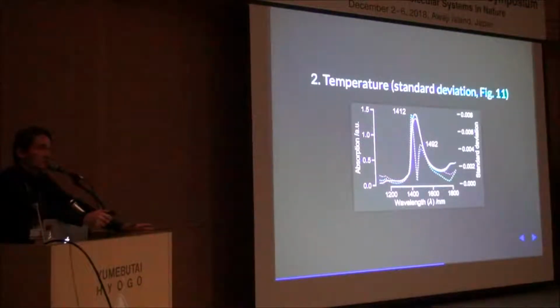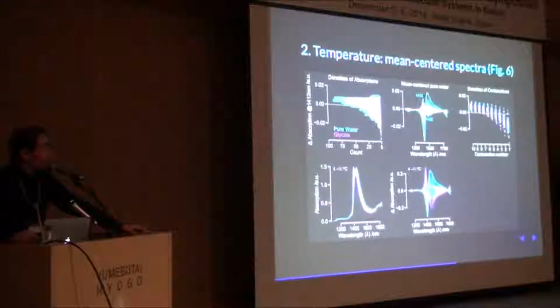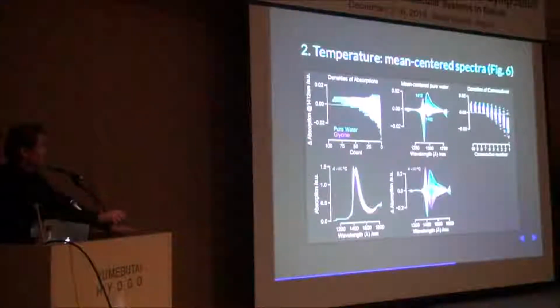So standard deviation is basically a variation around the mean value. If you have water in these solutions, that's your mean value, and the water-related near-infrared bands are what the standard deviation is telling you. So directly from this picture, you can learn that the third decimal are the bands of glycine. They go up and down depending on the concentration, but the third decimal is where they are located. Okay, so this is a little bit busy slide, but it's really telling us a lot.